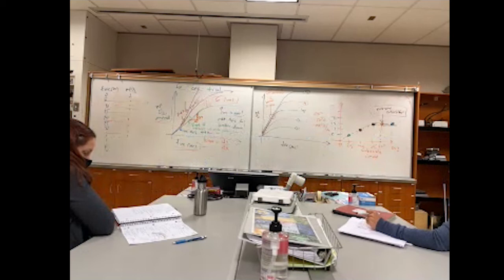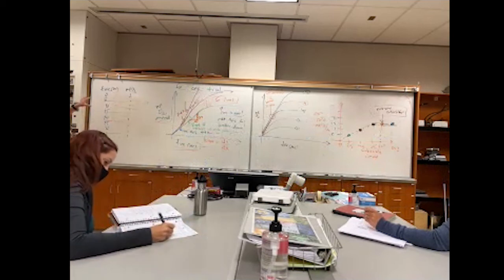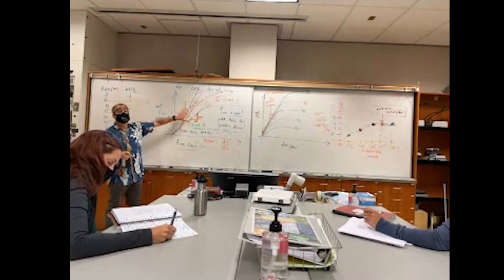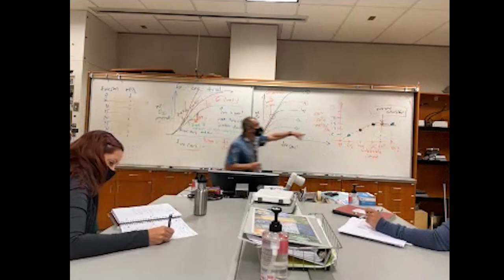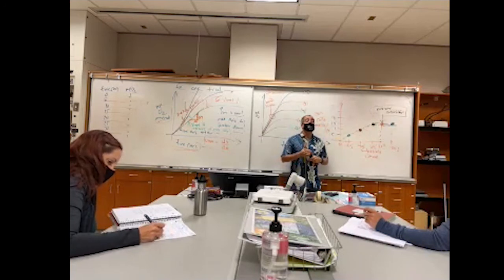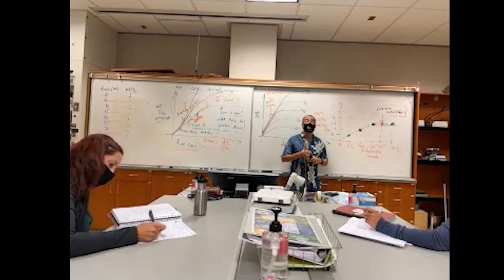That data is where you're going to start to make these graphs, the time versus oxygen, calculate the slope, ultimately get this and answer the question that you all asked, hopefully.